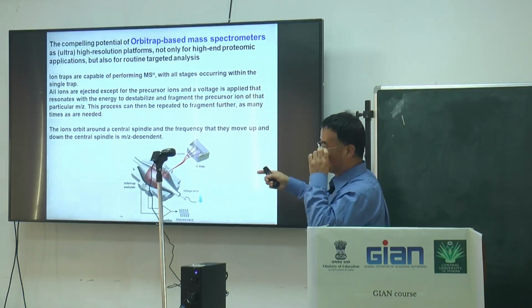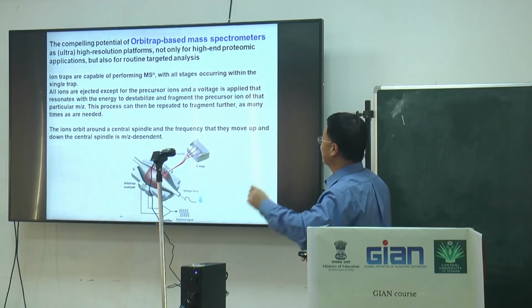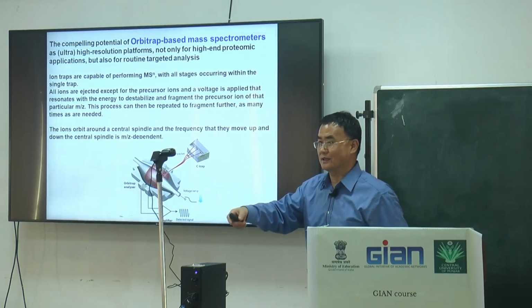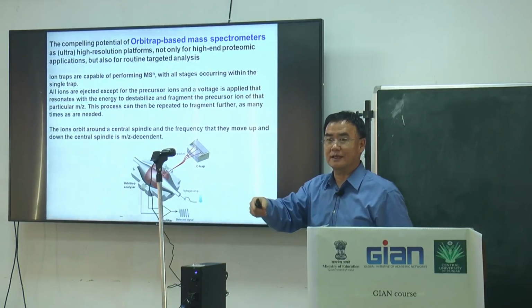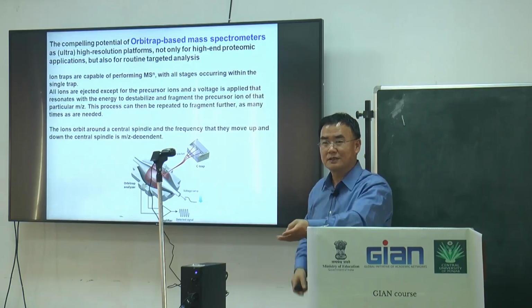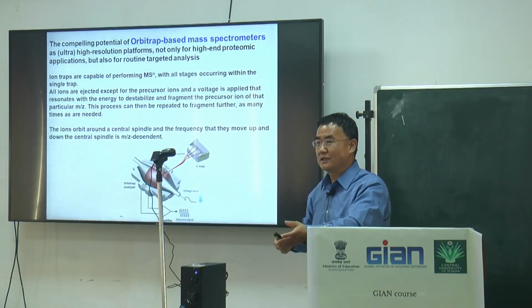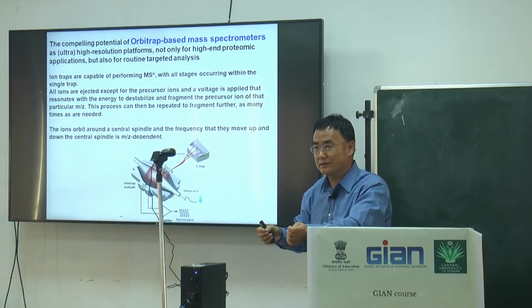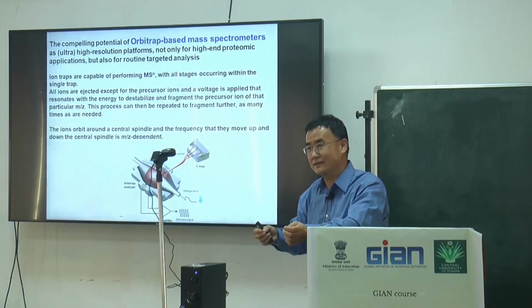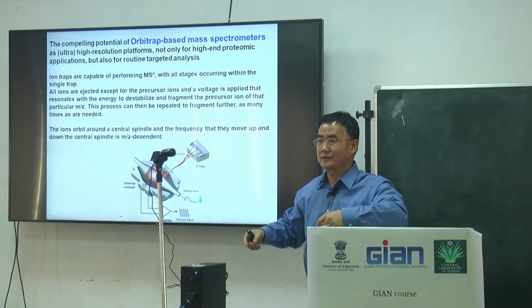But for this machine, it is covered, just a big box, and you apply the sample and you get the proteomic data. Then you analyze the proteomics; of course, you need to do some pre-digestion, right? Use trypsin, the enzyme to digest your whole protein into different fragments.